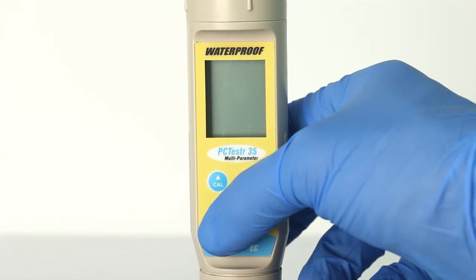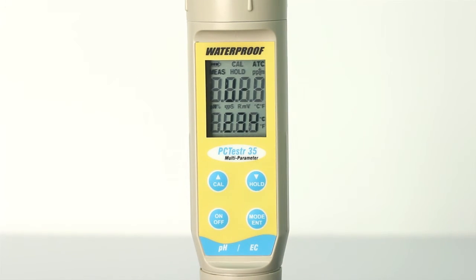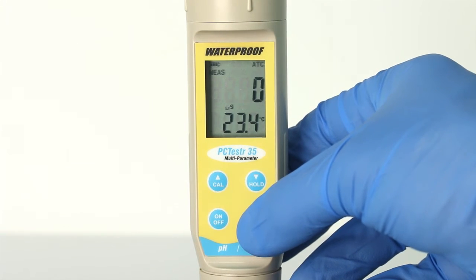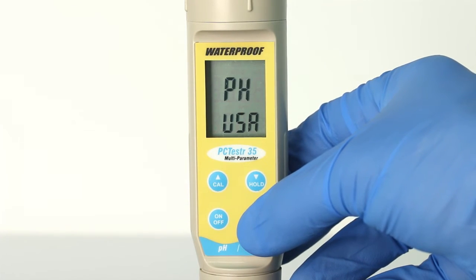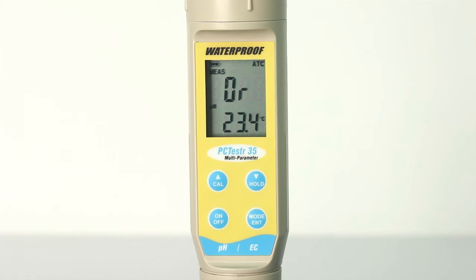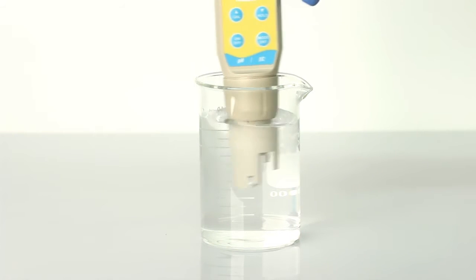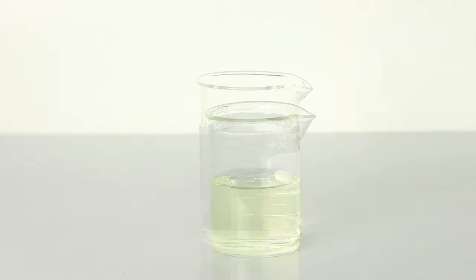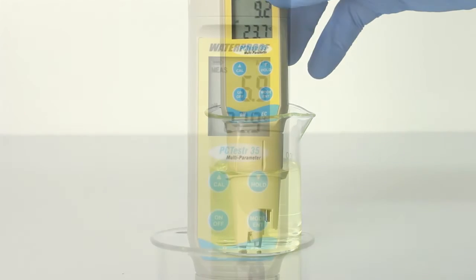Press the ON-OFF button to turn the meter on and MODE ENTER to select pH mode as needed. Rinse the sensor with clean water, then immerse the sensor into your pH buffer and press CAL.